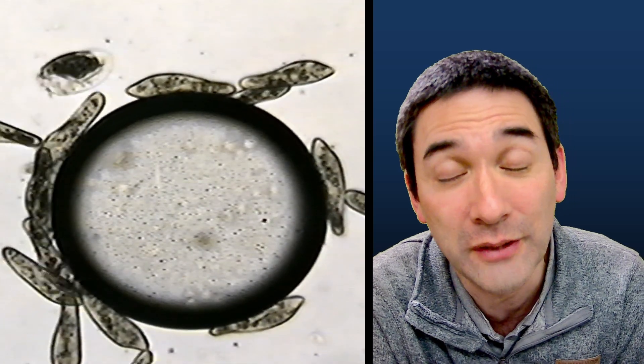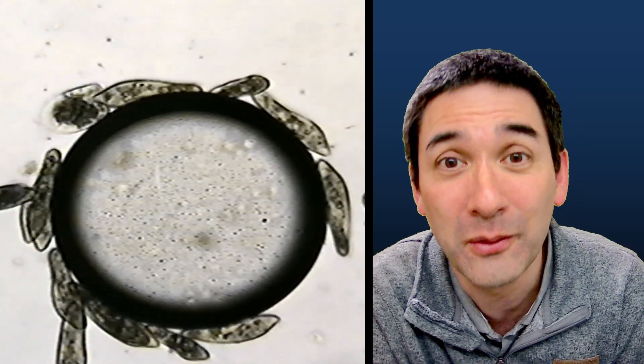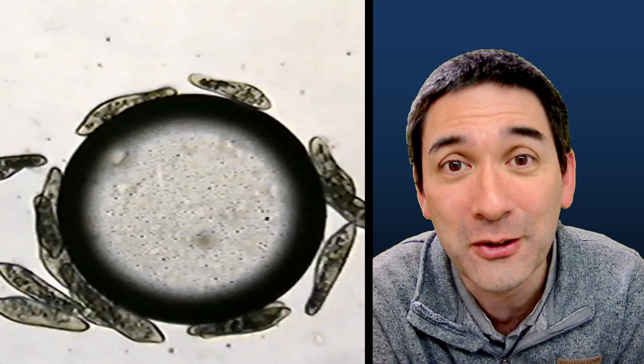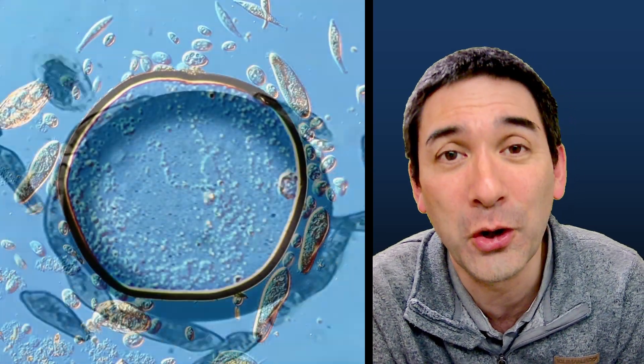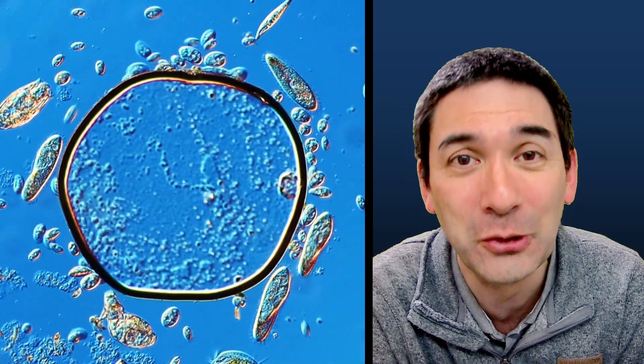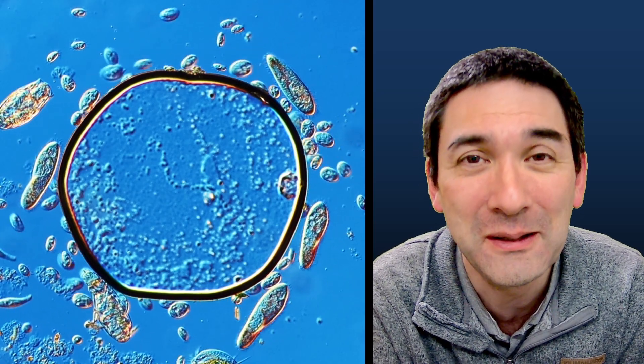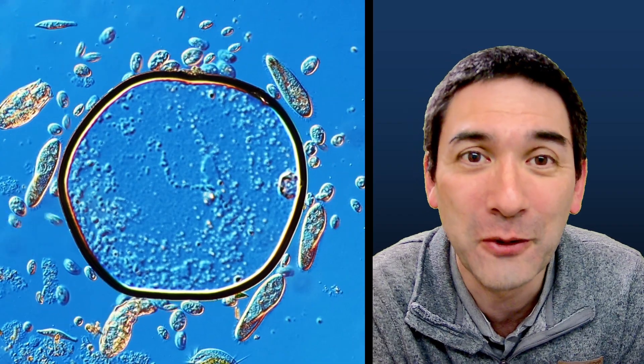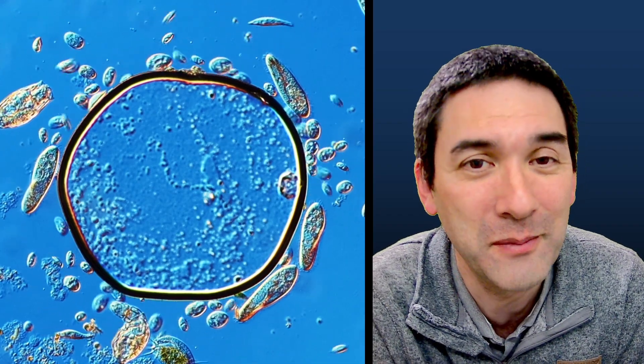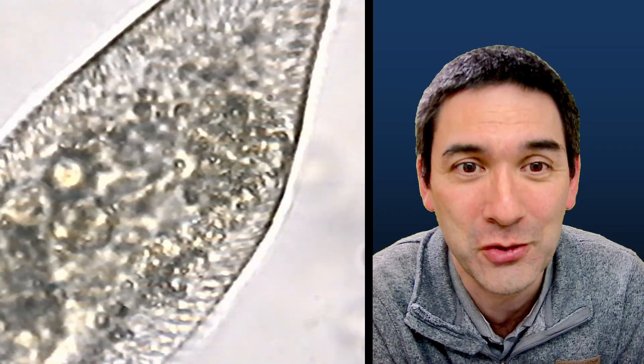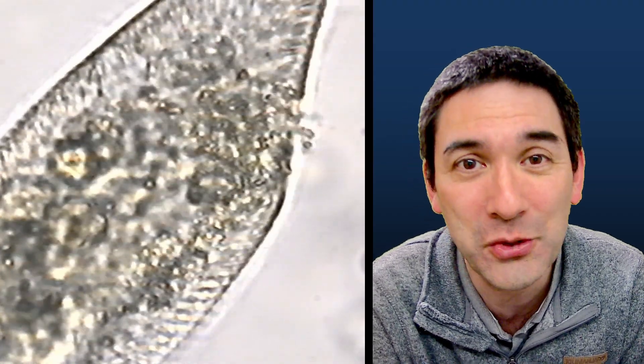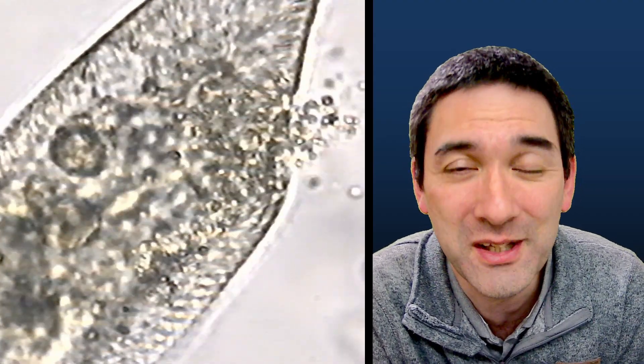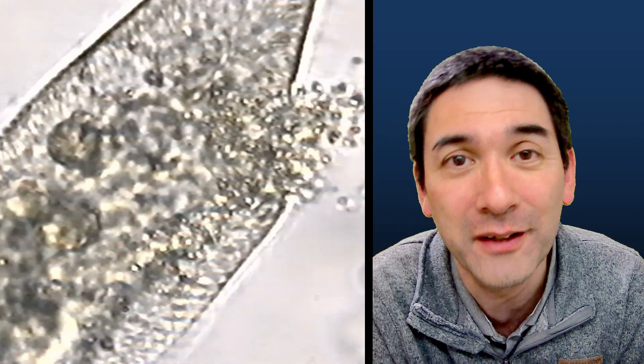In the meantime, almost 23 years later, of course our microscopy hardware has improved quite a bit and this is how it looks using modern equipment. Still, some things do not change. Again, here we've got those little microbes gathering around the air bubble under the microscope slide, and this one over here is a close-up of one of those cells actually expelling some of the undigested material.